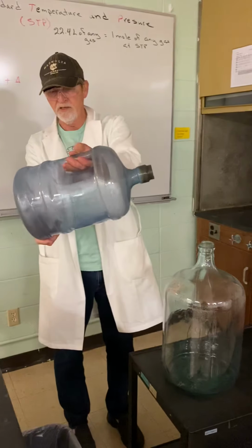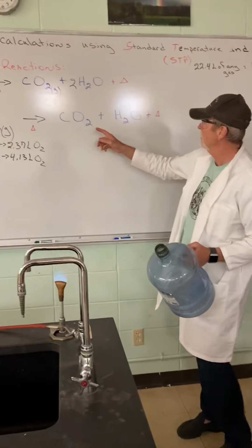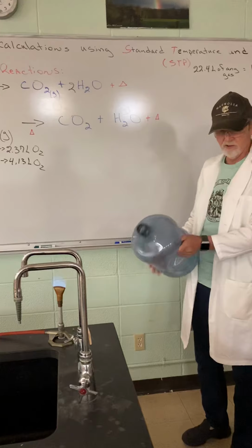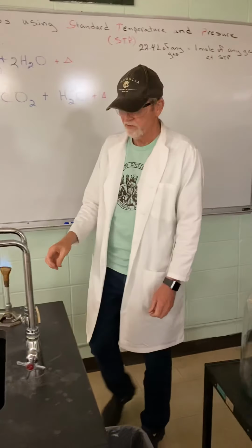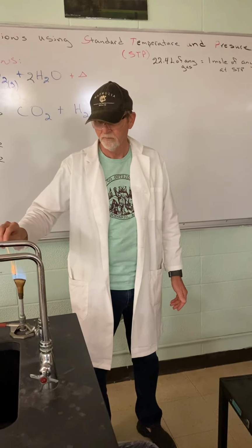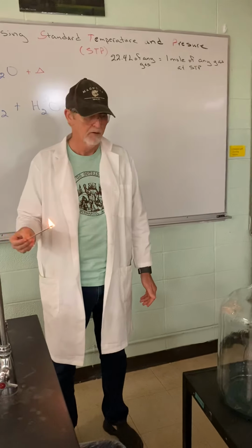We see some condensation on the inside, which is evidence of the water present, obviously warm. Okay, so next we're going to do the larger container.